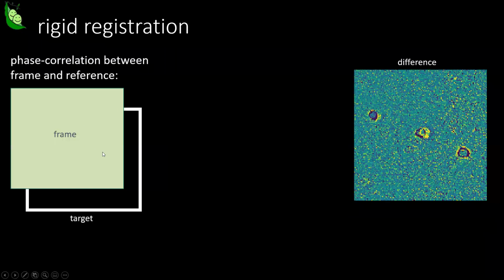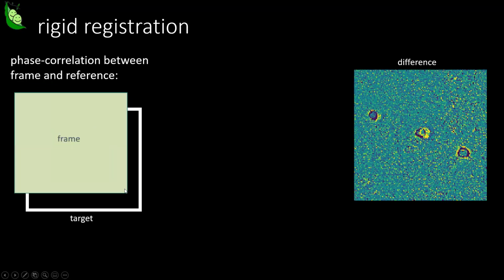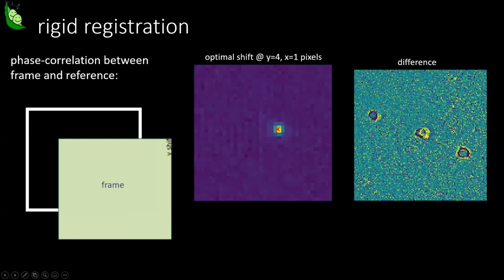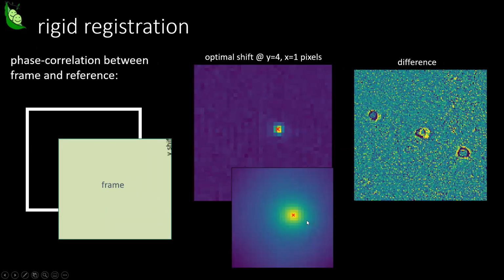You take this frame and run it across every possible pixel shift on the target image, the reference image. We move it across, and that creates this matrix, this correlation map, which in this case on the whitened images has a sharp peak specifically at this location. But if I didn't whiten my images first, you get something that looks more like a blob. So we're able to get better accuracy when we do this phase correlation step first. You can also turn off this step in suite2p, but I wouldn't recommend it.